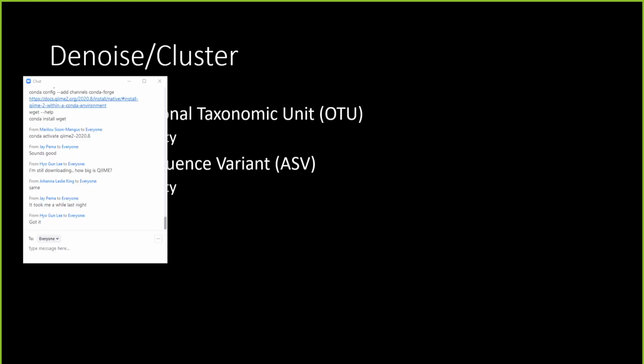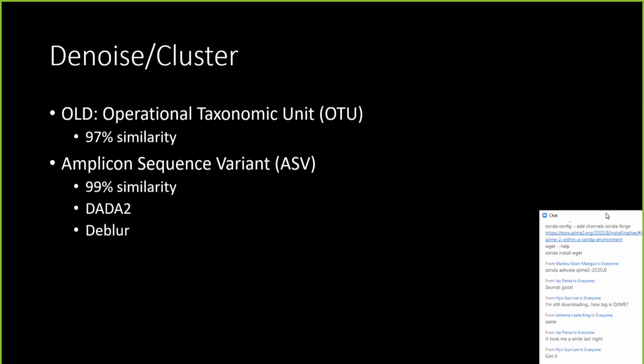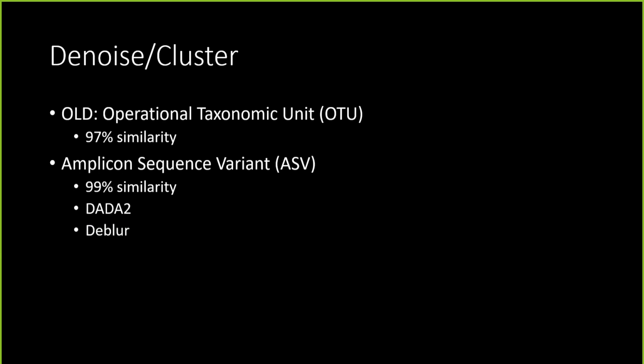Let me specify about DADA2 and OTU. So for ASV normally, if you want to really look at diversity, because that's the variants, for instance, really show you how diverse your community is. But it doesn't mean that it's diverse in function. So there's something you need to actually think about too. So OTU group them by genus level. So this is a conservative way of looking at, well, trying to deduce their functions.